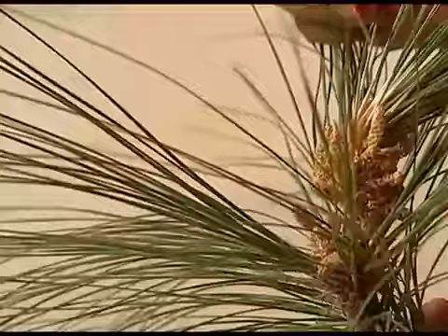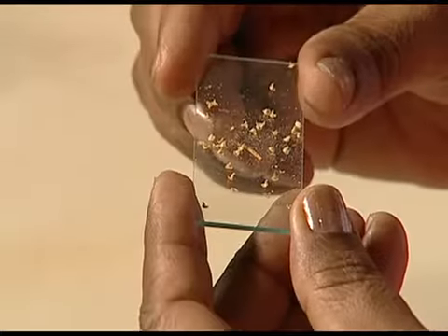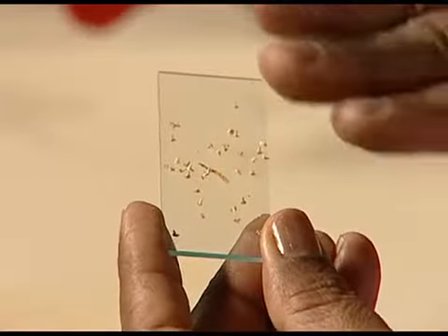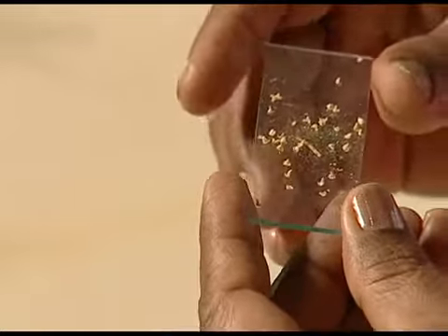We will take a male pine cone and sprinkle the pieces of the male pine cone on the slide. We can see some scales and the powder which is settled at the bottom of the slide is what we are going to see with the hand lens.